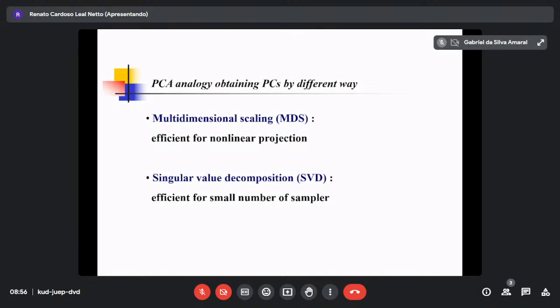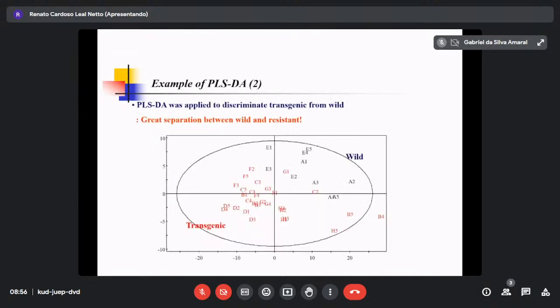Now, principal component, one more thing. When you do principal component analysis, you see this kind of circle. We call it Hotelling's 95% line. What does it mean? When you do principal component analysis, in many cases you can see this black line. I didn't draw this one.